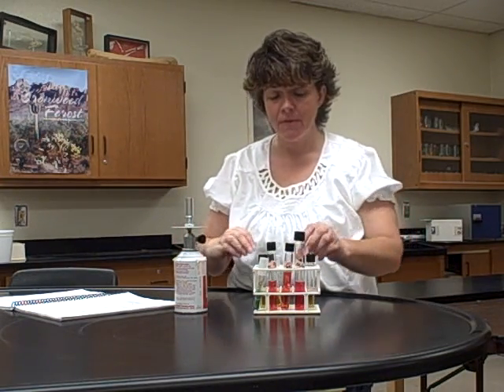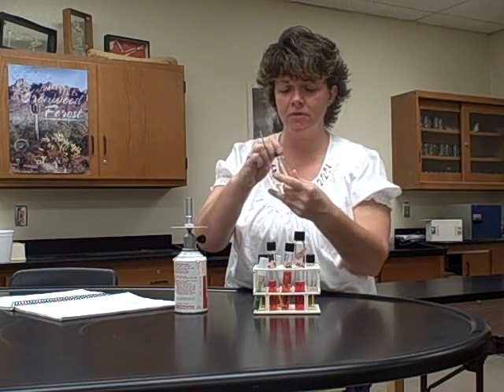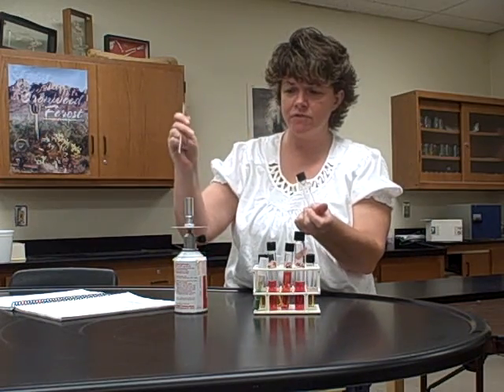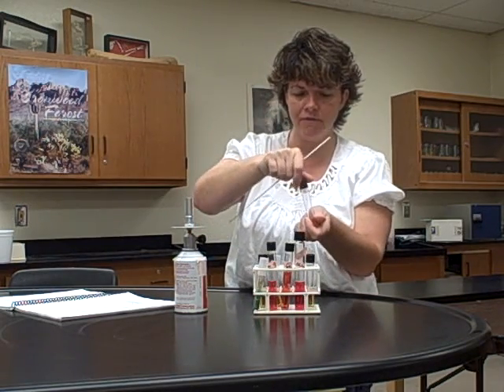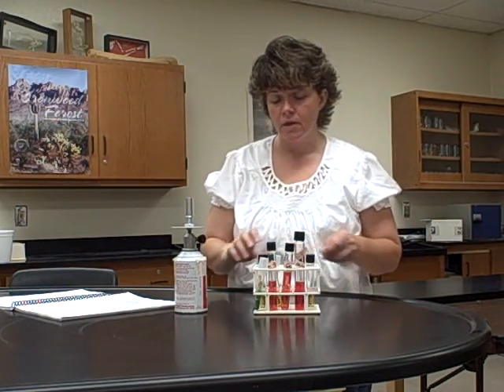I'm not going to open these up. I don't want to keep wasting media, but once again, you're holding it with 2 hands. Loosen this one first, and then after you've sterilized your loop, you're going to pull off the 2 lids, go from here into there. So we're going to put E. coli into 2 of them and put Enterobacter into the other 2.